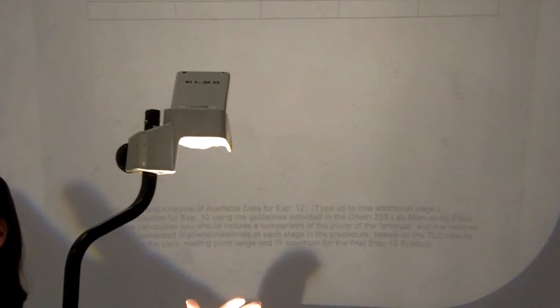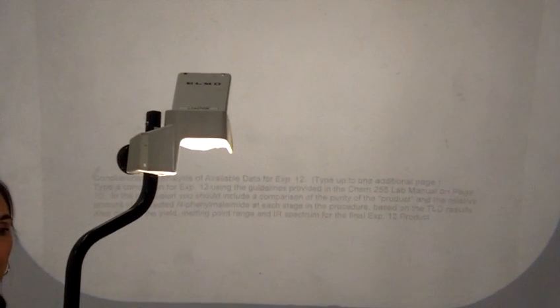On the backside is the IR. You'll put in all the information for the IR, and you can compare it to the IR spectra that will be on Moodle. Make sure you fill this out completely and analyze it. You may or may not have an IR spectrum that completely makes sense. If there are peaks in there that don't belong, make sure you identify those peaks. Then you will write a conclusion and attach it to this along with the IR data, and your instructor will give you more specifics for that conclusion. So experiment 12 is a worksheet, not so much a report in your notebook.